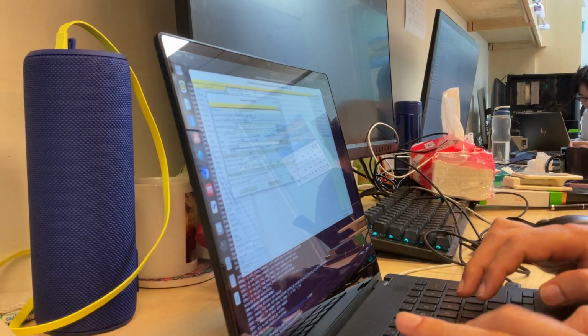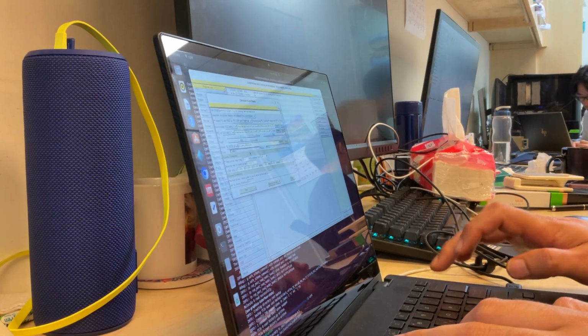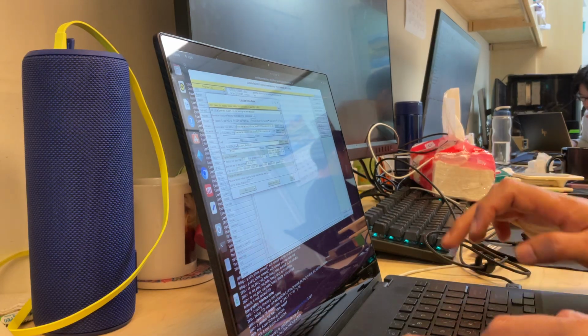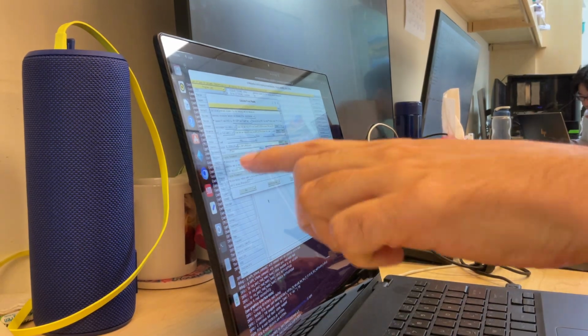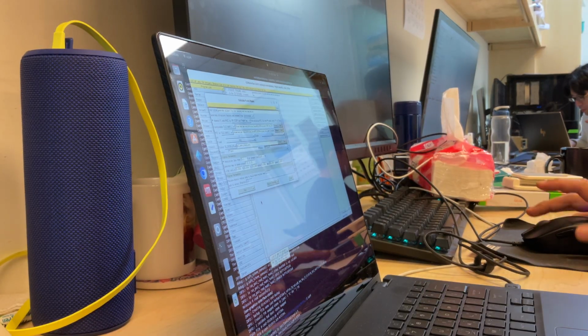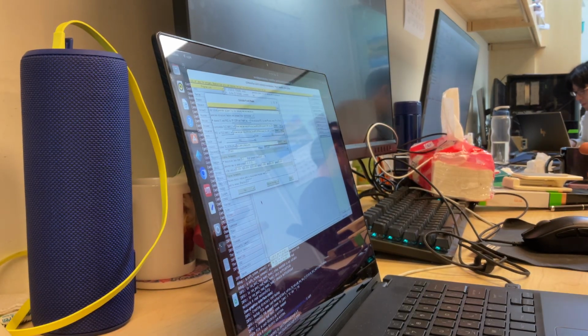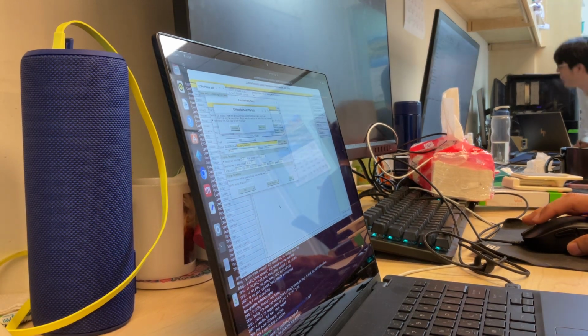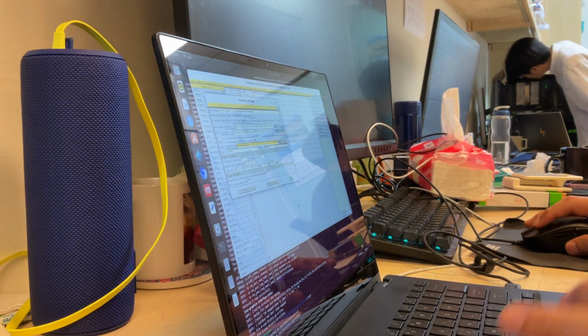Well, no, let's call it FC dark, and PHIC dark, in this way. So the labels of this, we call them FC dark and PHIC dark because later you may combine it with the different time points. And in this way, it's clear what it is. Okay, so we just run it and we just tell it to overwrite it.